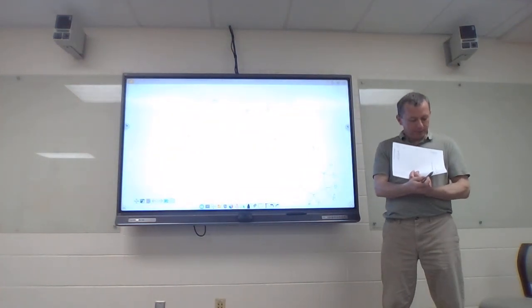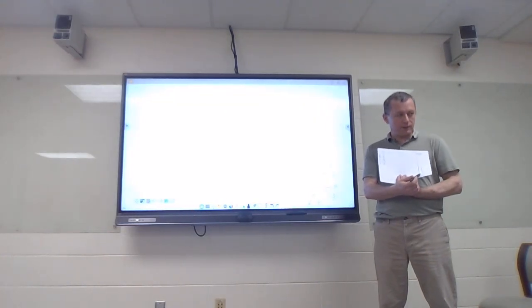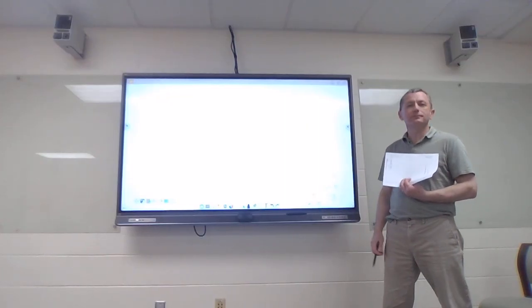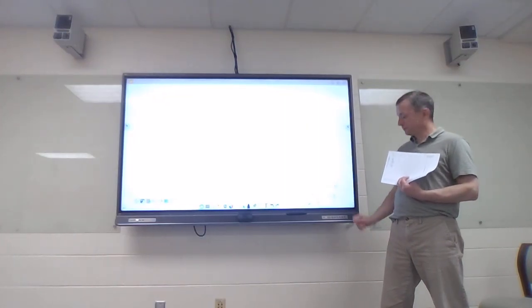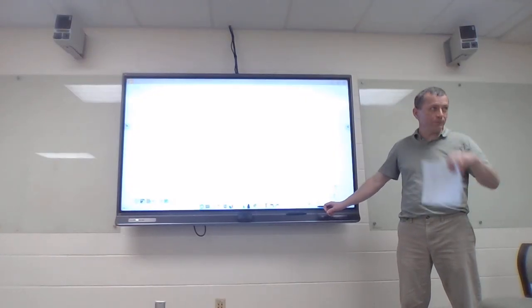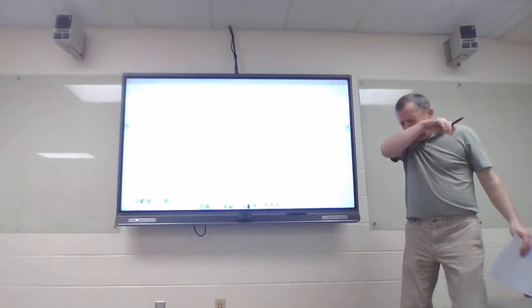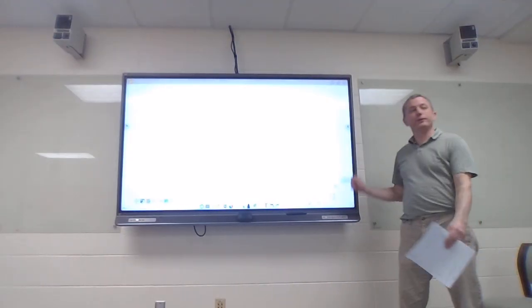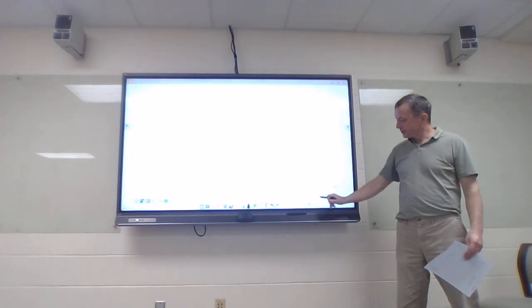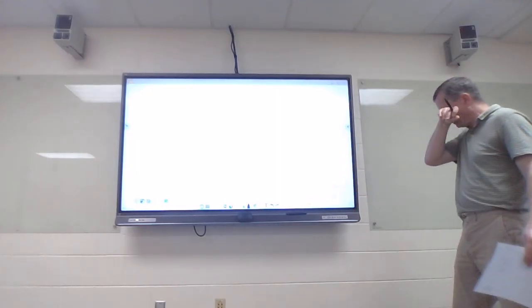Now, chemical shift though, right? You can see how these 2 are quite close to each other. How do I know which one's this and which one's that? This one integrates to 2, and that one integrates to 1, which is really a 2 to 4 to 4 ratio versus a 1 to 2 to 2 because of the duplication here. So this has to be the peak that's integrating to 1. This has to be the peak integrating to 2.